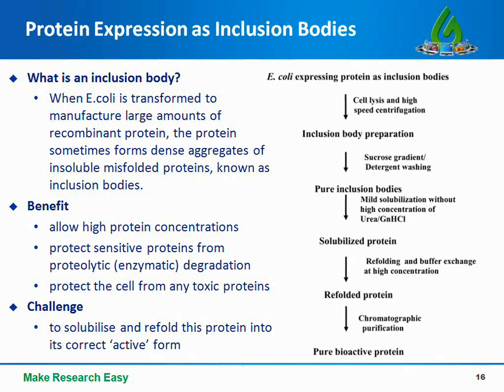Inclusion body is not necessarily a negative factor. The benefit from a production aspect of inclusion bodies is that they allow high protein concentrations, protect sensitive proteins from proteolytic degradation, and protect the cell from any toxic proteins. However, the big challenge is to solubilize and refold the protein into its correct active form.